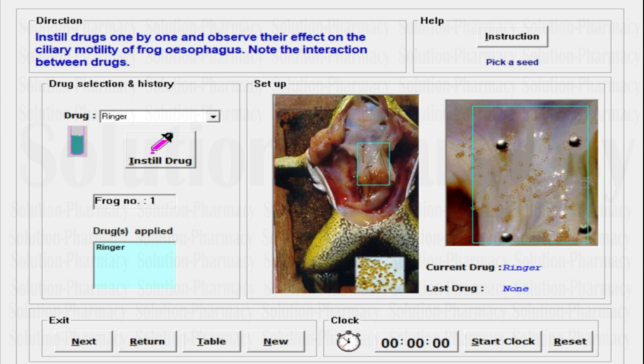Hello friends, welcome to the channel Solution. In today's experimental video, we are going to study another in silico method of pharmacological experiment. Our objective is to study the effect of drugs on the ciliary motility of frog esophagus. This experiment is going to be very important and very interesting. Let's start the practical with the understanding of the basic interface of this simulation software.